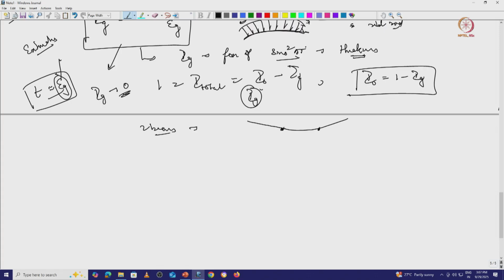So you are tilting your sample in such a way that your Ewald sphere is only cutting the transmitted and diffracted spot. So even if one set of plane is diffracting, if your sample thickness is psi g, then there will be no diffraction spot. You will not see any diffraction spot, you will always see only the transmitted spot. Why? Because your thickness is near to the psi g, which is the extinction distance.